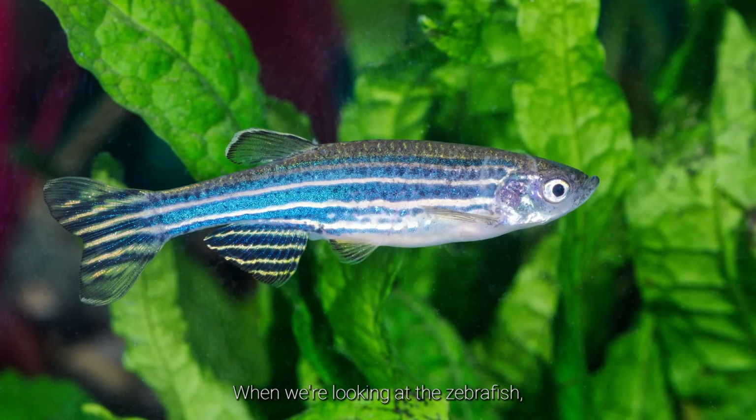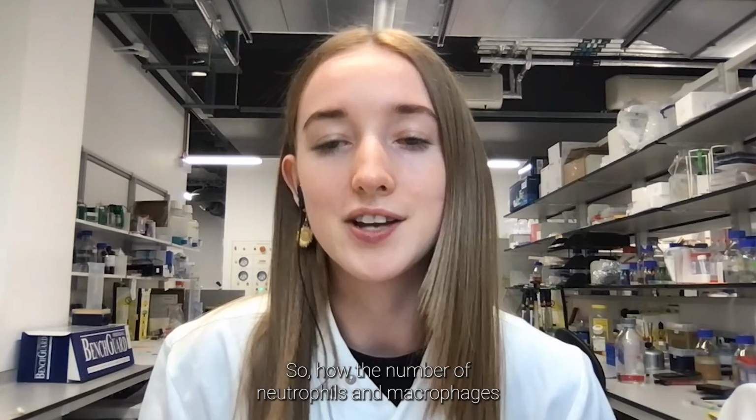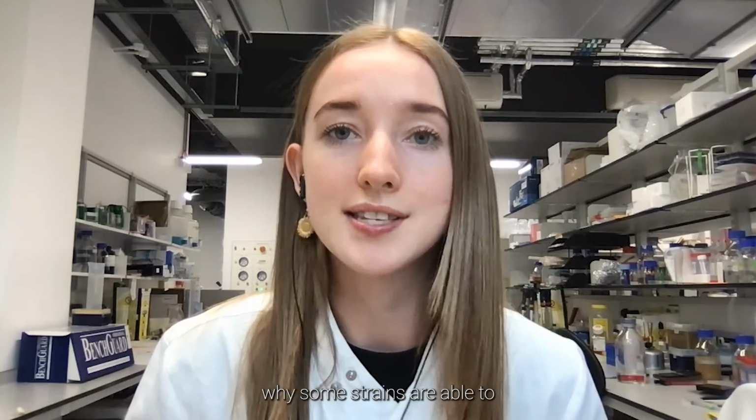When we're looking at the zebrafish, what we're looking for is differences in host response, so how the number of neutrophils and macrophages in a zebrafish changes over time. And this will help us understand why some strains are able to infect humans better than others.